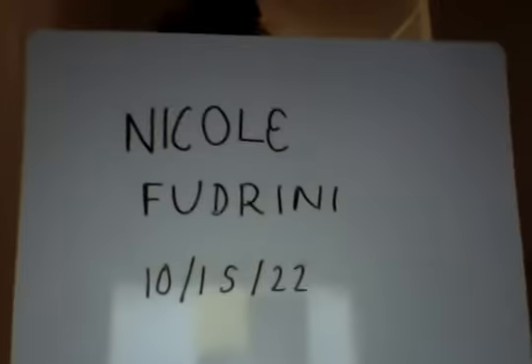Here is my sheet with my name and today's date on it. And today we're going to be going over the chicken wing dissection that I've just completed, as well as answering a few questions about synovial joints. So to begin, I have my chicken wing right here.